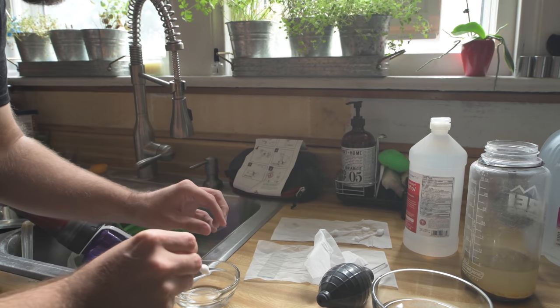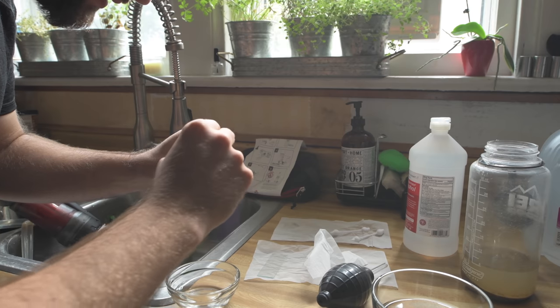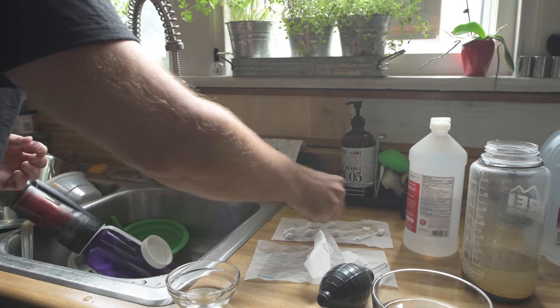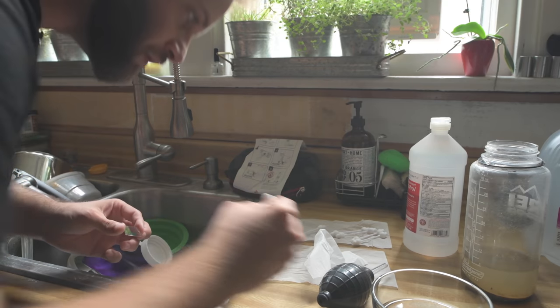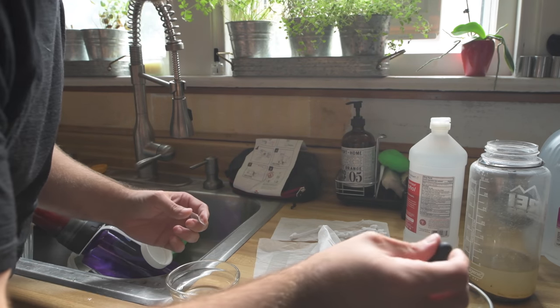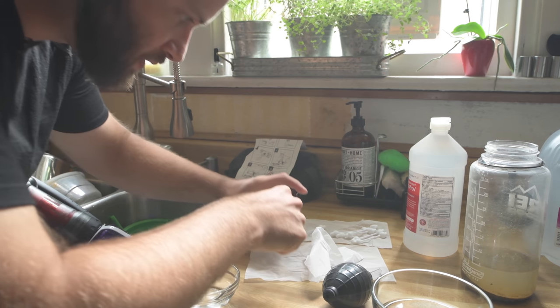Fresh Q-tip, so we're going to try to wash off the surface of this. I am not very good at this. Seems like there's a whole art just to cleaning slides and cover slips. Same thing with the cover slide. Okay, now using a fresh dropper here, I'm going to take some of the water that we just filtered, purified, whatever. And let's go take a look at that.